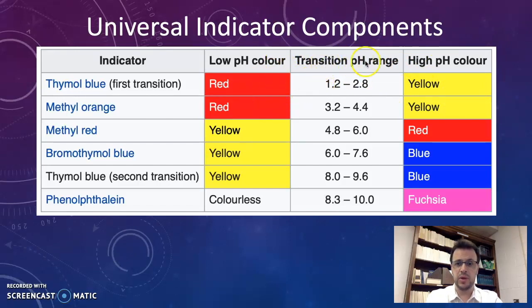So the red mixes with this yellow, mixes with this red, and becomes a dark orange. And as the pH level rises, you start going through into just yellow as you come through all of these. And then to the upper level, we start to get into the greens and the blues and the indigos. So the reaction we just saw actually has multiple stages, and I'm going to break these up one at a time and talk about them individually.